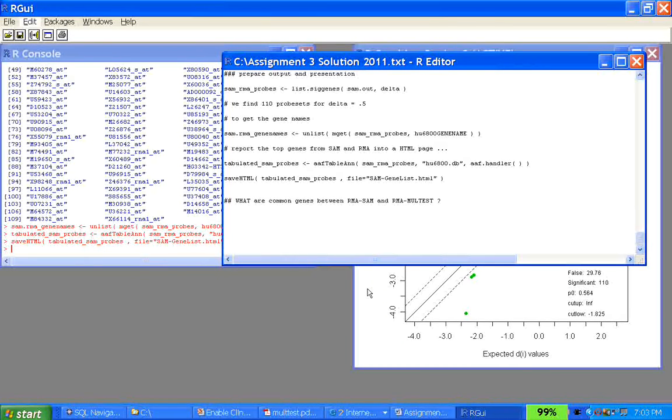When you did the mt.maxT method, the adjusted p-values were really high. When you did the SAM method, your FDR was really high, about 15%. So if you want to be very confident, but you're setting up this criteria, you're losing power. So then the question comes: do you not do those multi-test or SAM, or do you just rely on a simple t-test for your normal distribution, right? Then you get more features.